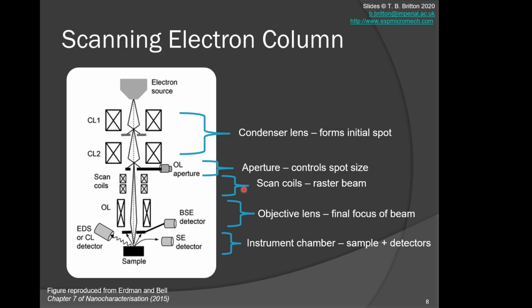So imagine that we have that focused probe. Well, how do we get to the point that we have the focused probe? This is where we require ourselves to have a relatively reasonable ray diagram. The SEM was originally developed from the transmission electron microscope, but it has a lot more synchronization and a few more bits and pieces.